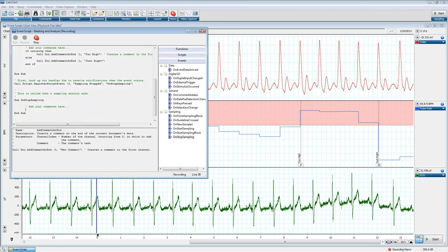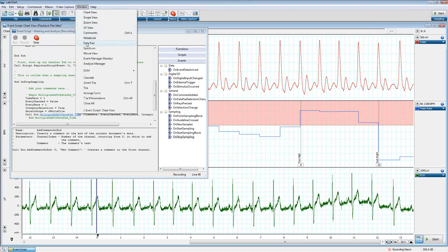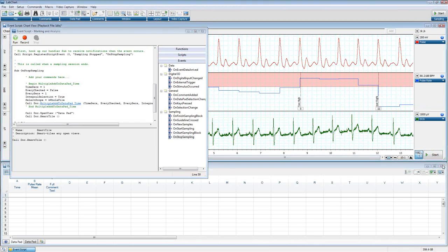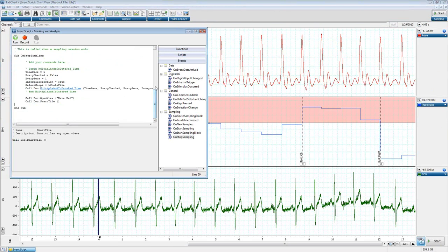We're going to record. We're going to do our commands, multiple add to data pad. Click OK. We're going to Window, open the data pad, and then we're going to click on Smart Tile. Stop recording. Okay. So that should work. When we're done recording, we're going to do those steps.